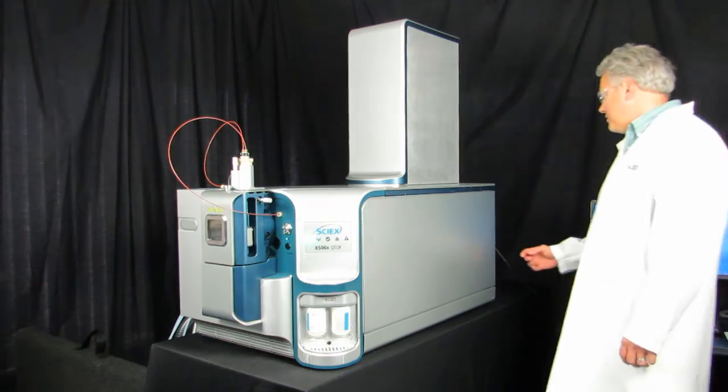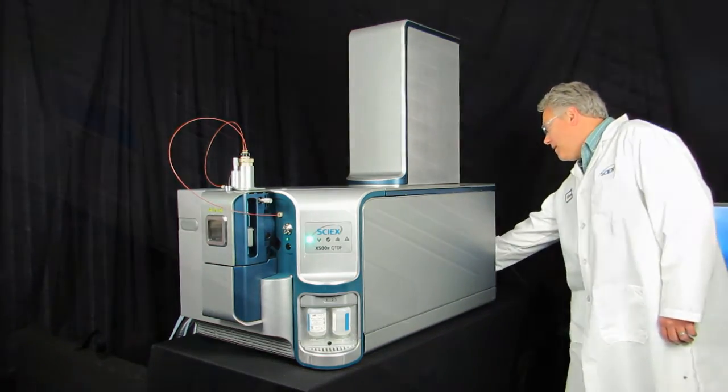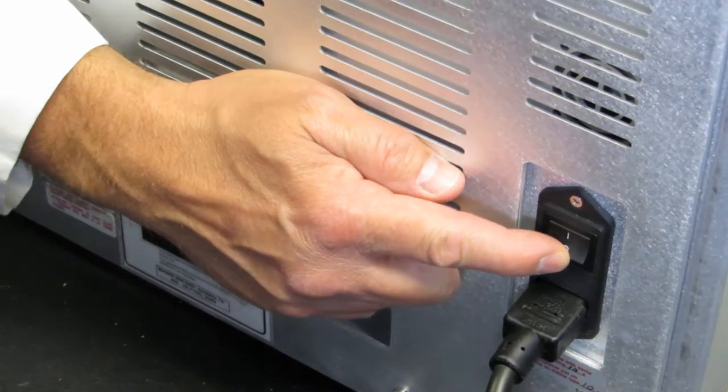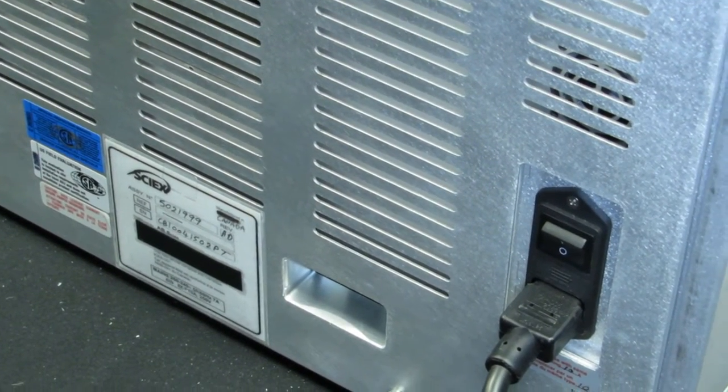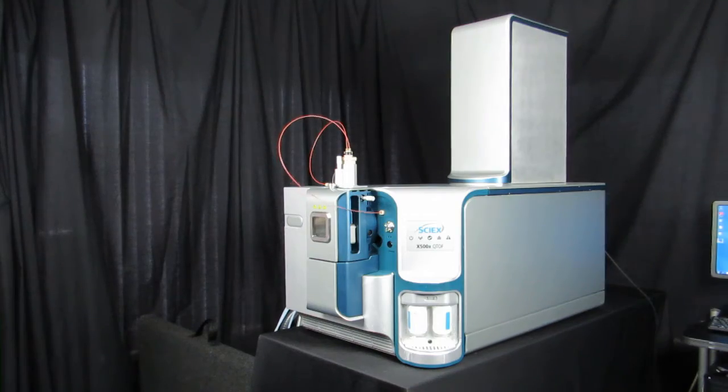Then, turn off the mass spectrometer convenience switch. Turn off the roughing pump.